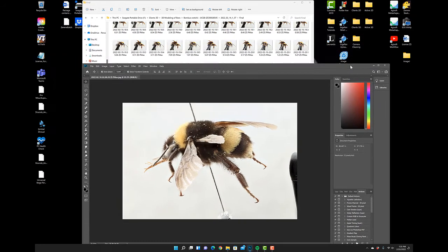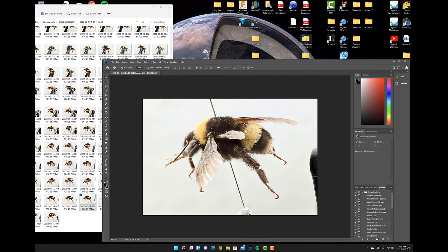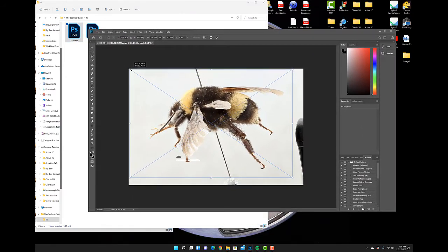So what we're going to do is navigate to the scale bar suite, which everybody has. We're going to select the 1x scale bar. Because we have a white background, we're going to choose a black scale bar. And we are going to size it up so that it matches the camera sensor. Now, of course, for obvious reasons, if there's any cropping or batch image cropping, you'll want to do this before you do a batch image crop, or else you're going to lose the ability to apply a proper scale bar.